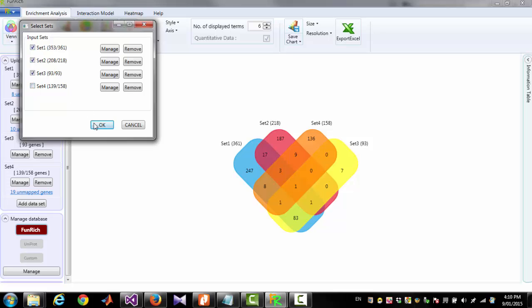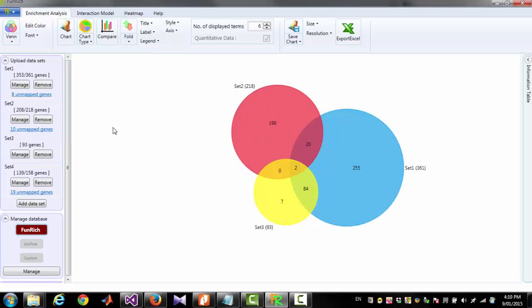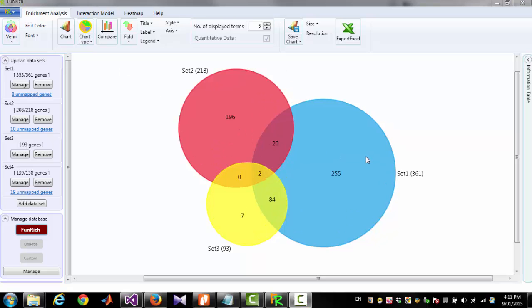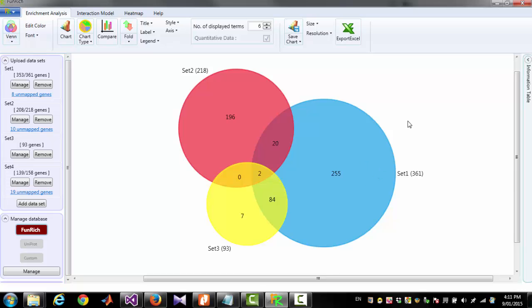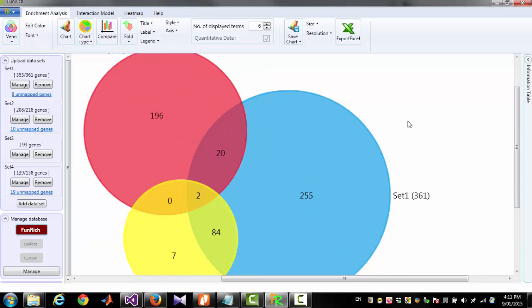I am unchecking one set. So now Venn Diagram will show only 3 sets. You can use mouse scroll to zoom in and zoom out.